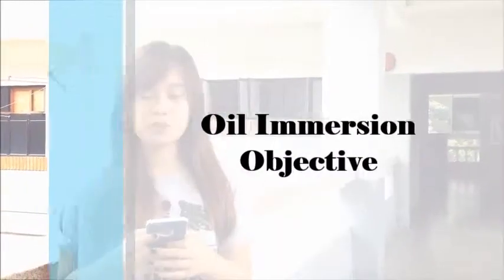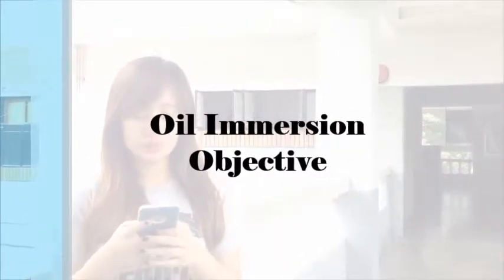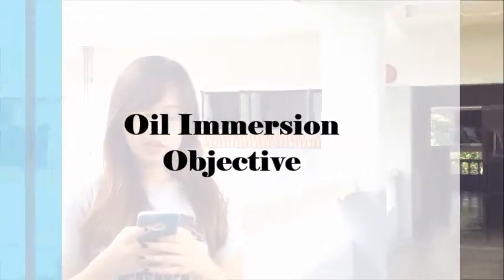Oil immersion objective, also known as OIO. This longest objective is used for observing the detail of individual cells, such as white blood cells and cells involved in spermatogenesis. The lens must be used with a specially formulated oil that creates a bridge between the tip of the objective and the coverslip.